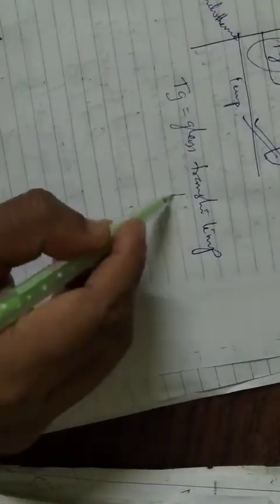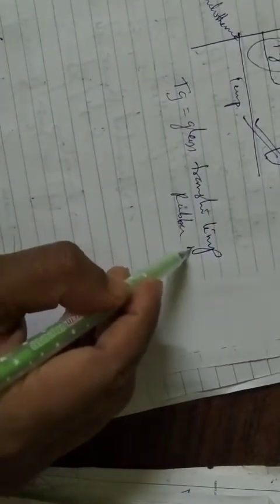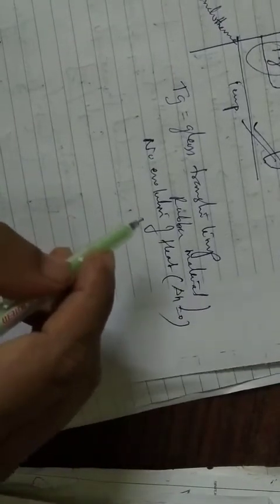Tg usually refers to the glass transition temperature, wherever there is a rubber type material. This is very important, and there is no evolution of heat. If there is no evolution of heat, then we take delta H equal to 0.